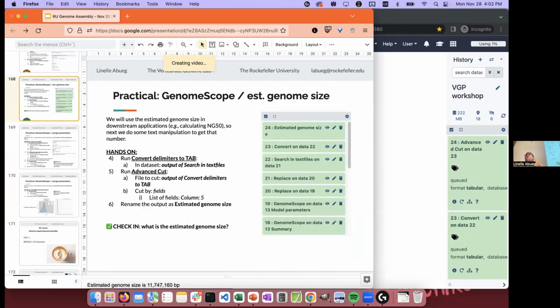The purge_dups parameters. Okay, I think I'll go on now to the next one. So this is just the genome size. A couple other parameters we use are related to coverage, because we'll talk more in depth about it when we get to purging. When we run contigging, sometimes you might not get a perfect primary assembly.